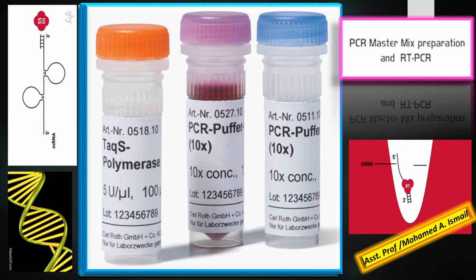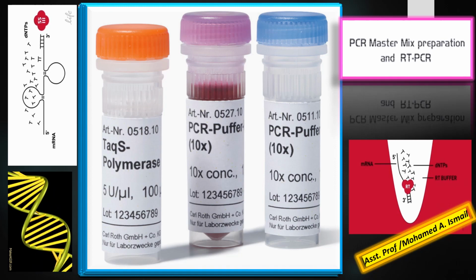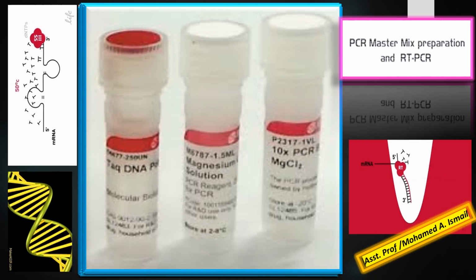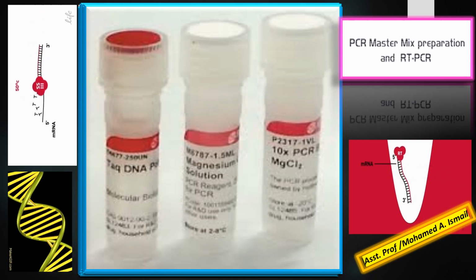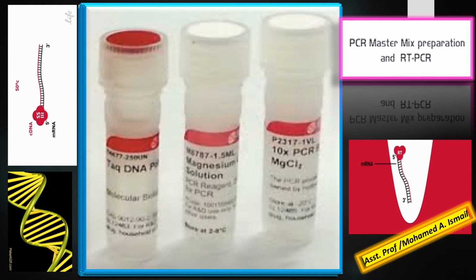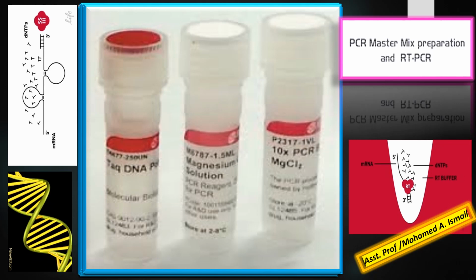This is an important point. Magnesium chloride is crucial for the activity of Taq polymerase, as it acts as a catalyst of the enzyme reaction.